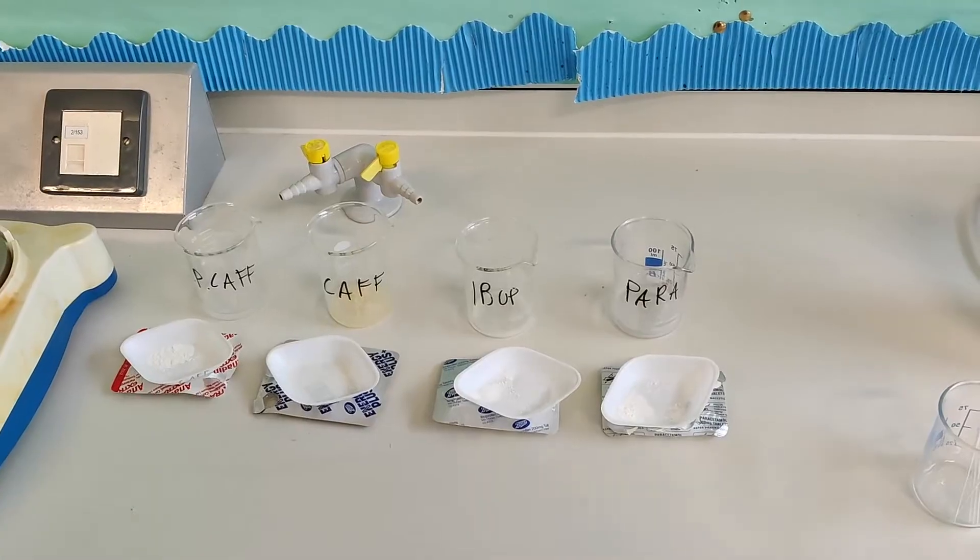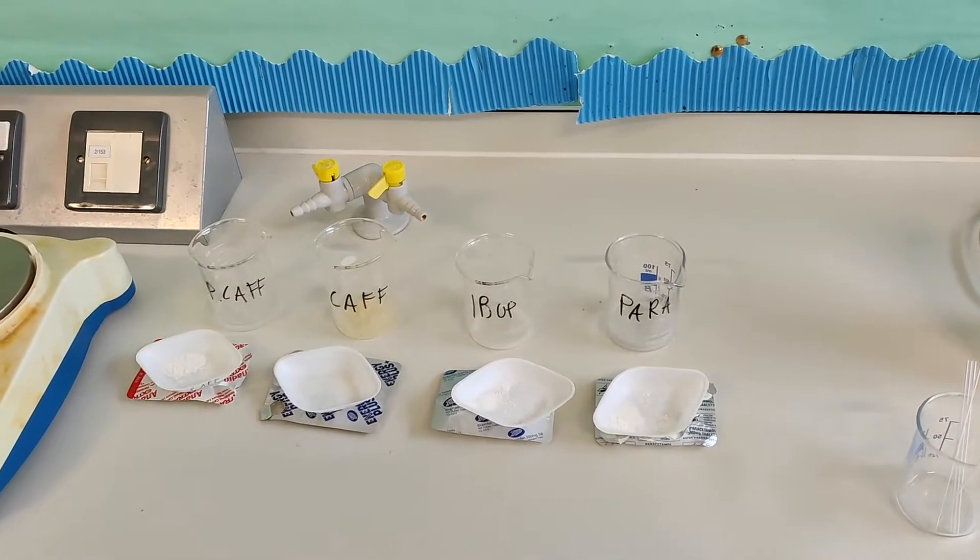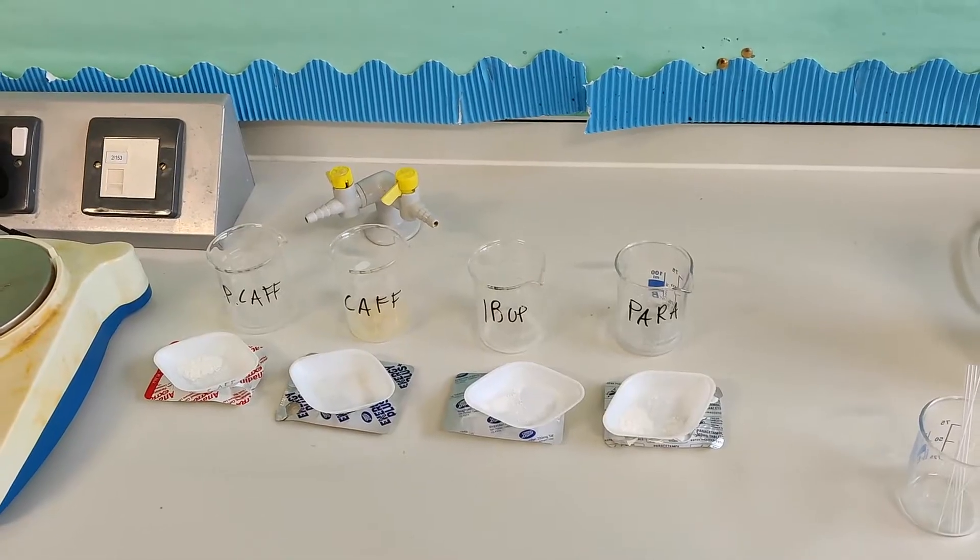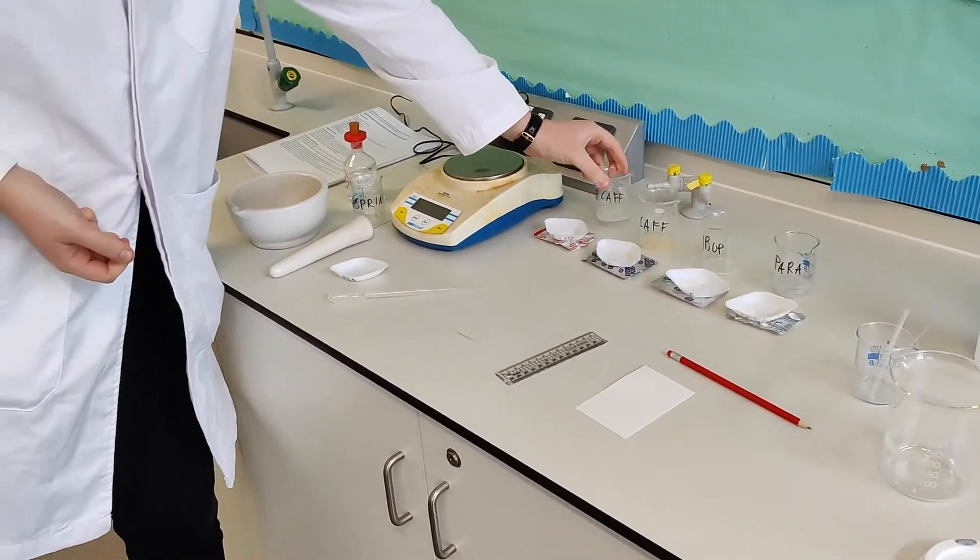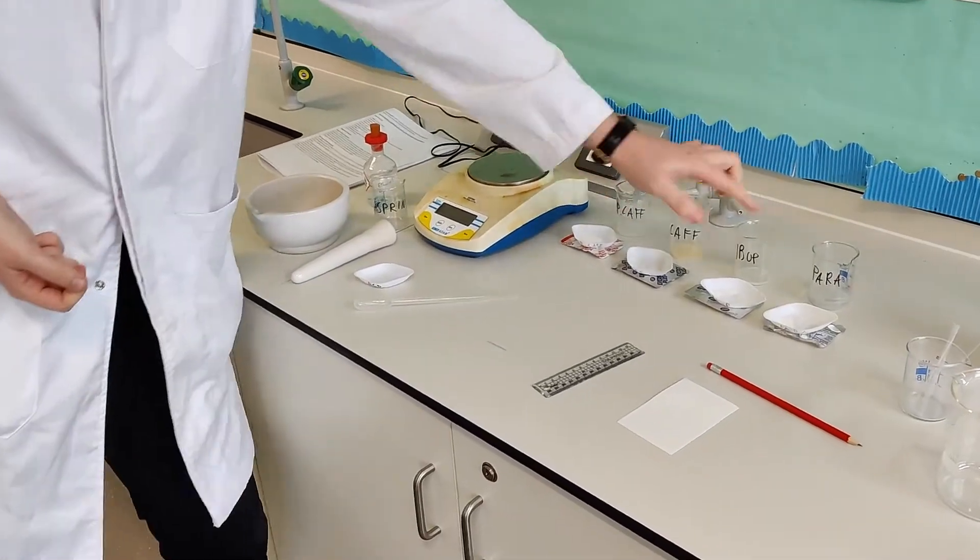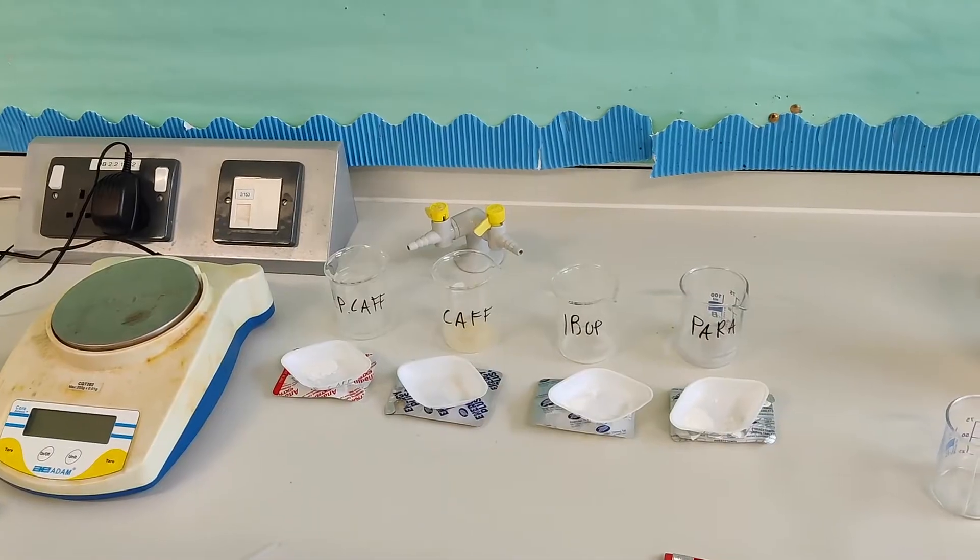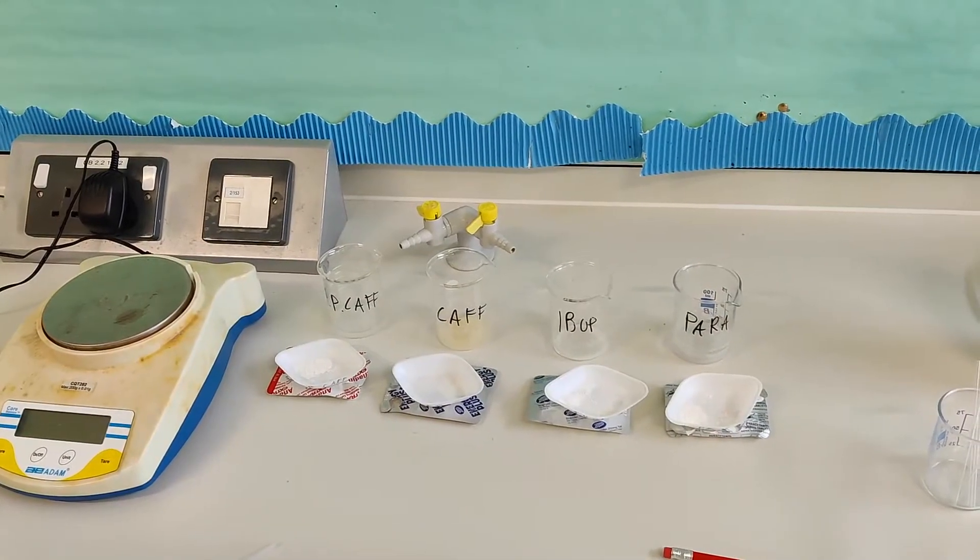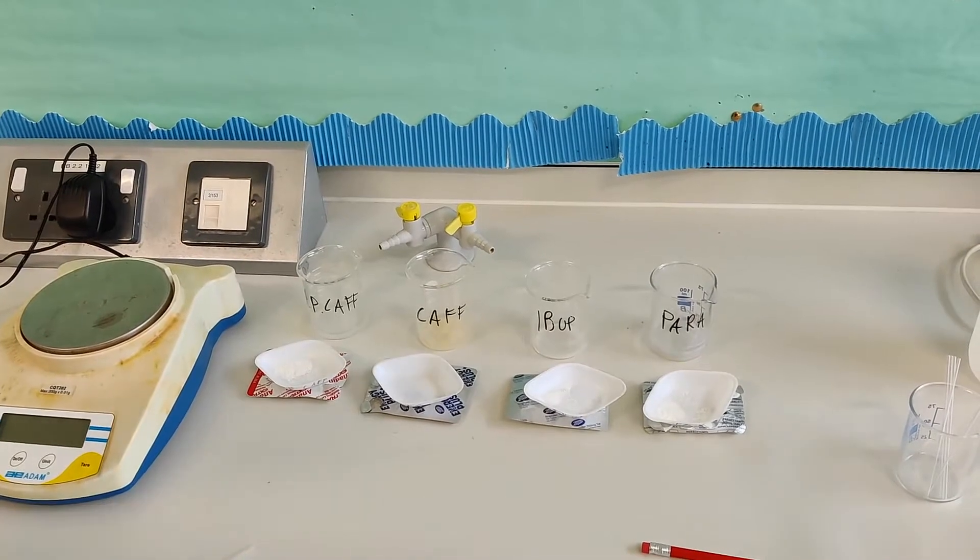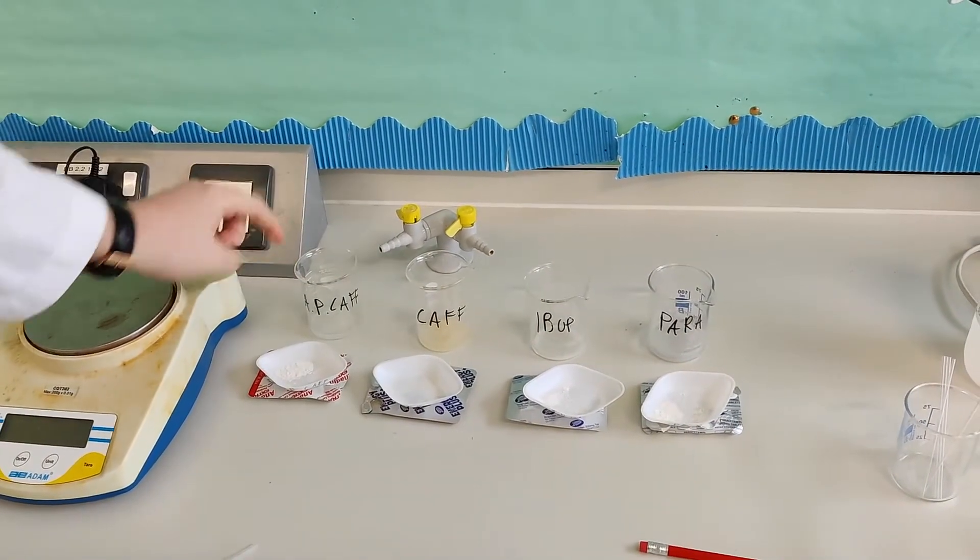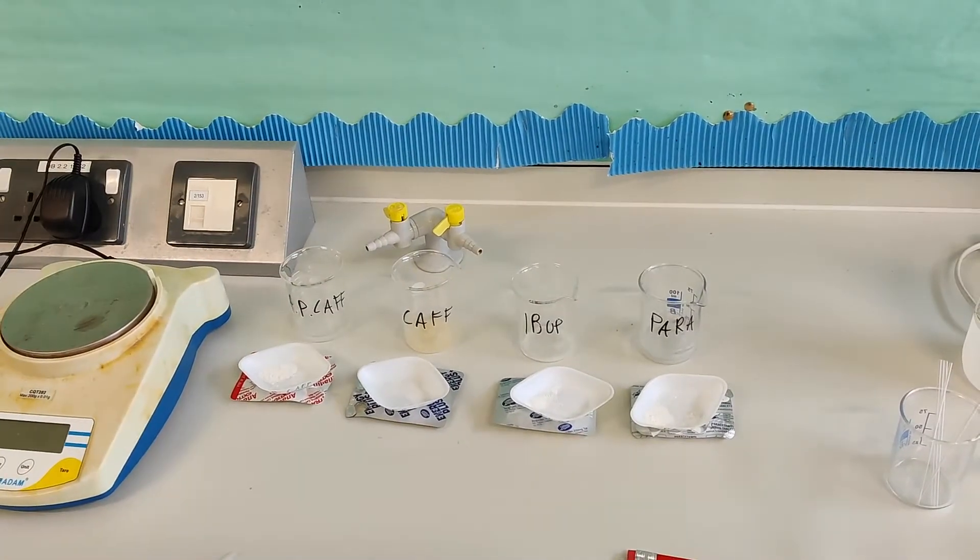And we put 0.1 grams of this fine powder and dissolve it into 0.5 cm³ of ethanol, which you can see here. Now, very important, I've labelled each of these beakers to make sure I know which drug is in which beaker. So for example, para just means paracetamol, ibup just means ibuprofen, then we've got caffeine, and then here we've got a mixture of aspirin, paracetamol, and caffeine.